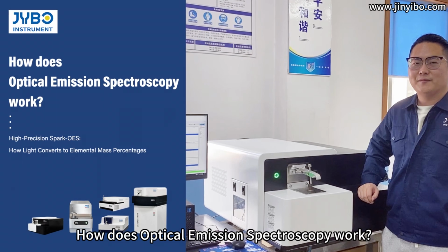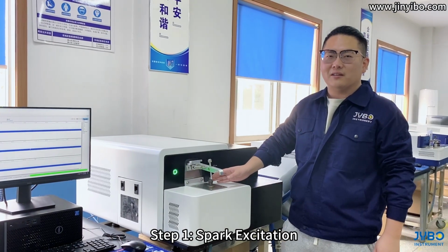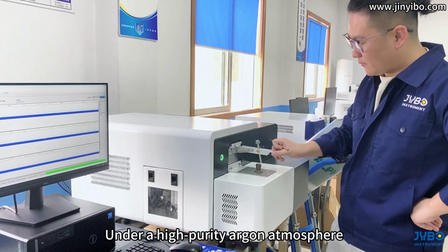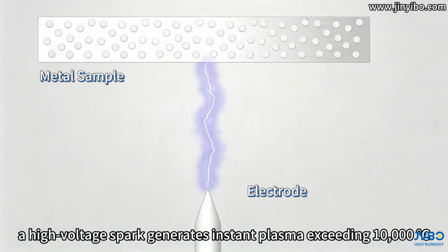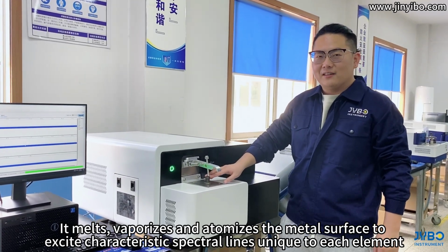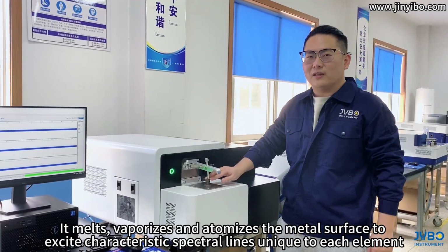How does optical emission spectroscopy work? Step 1. Spark excitation. Under a high-purity argon atmosphere, a high-voltage spark generates instant plasma exceeding 10,000 degrees Celsius. It melts, vaporizes and atomizes the metal surface to excite characteristic spectral lines unique to each element.